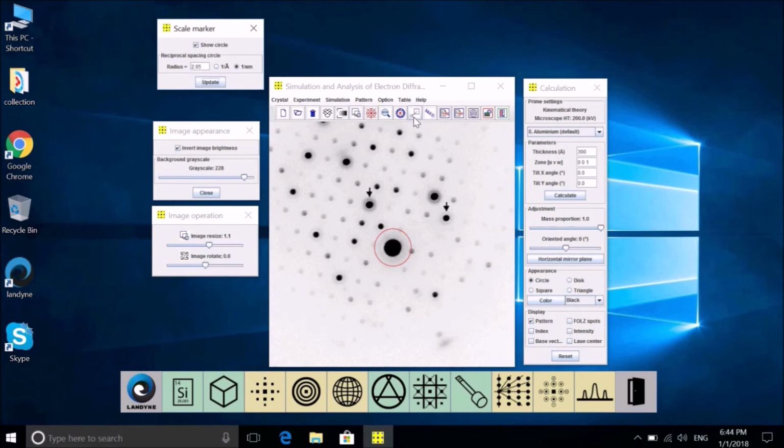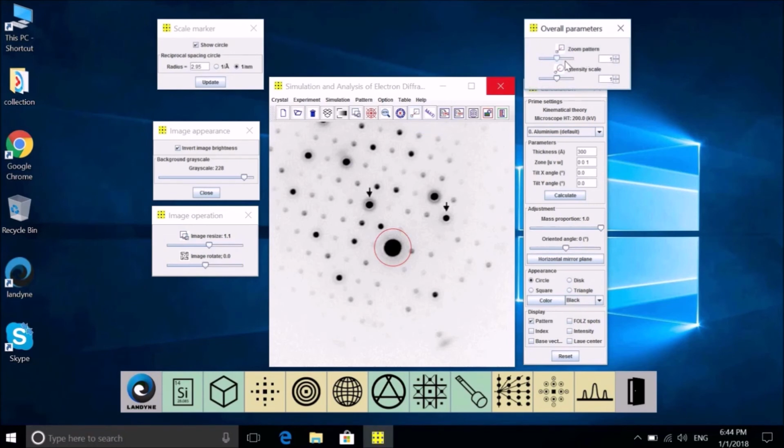So then come to the calibration part, and the pattern size here. We had to zoom here. Over here. So this one will show 2.639, and the circle covers to here. So we measured 2.95, 1 nanometers, and then after we zoom the pattern, use this value, we get the correct circle size. So we do the update here, and then do the calibration.